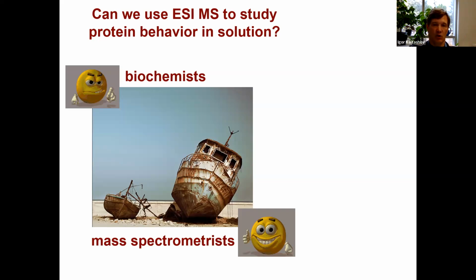So that should change its biophysical characteristics very significantly. And particularly in the past, I think now most people are convinced that mass spectrometry can deliver valid view of biopolymer interaction, high order structure, even though you do carry out your measurements in the gas phase, not in solution. But in the past, it was a very significant concern.